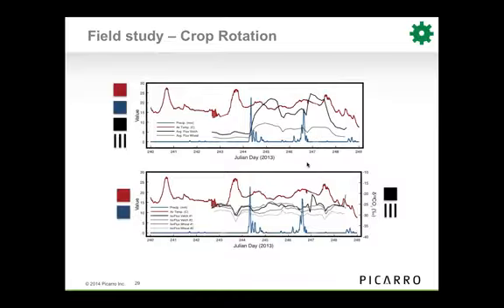What was interesting is that we had drought, or no precipitation, for about 30 days before the study started. And then in about 1.5 days, we had 2 significant moisture events, which really drove the CO2 flux, which you're seeing on the top here. The precipitation is in blue, the temperature is in red, the CO2 flux from the vetch is in black, and the CO2 flux from the wheat is in the dotted black line.